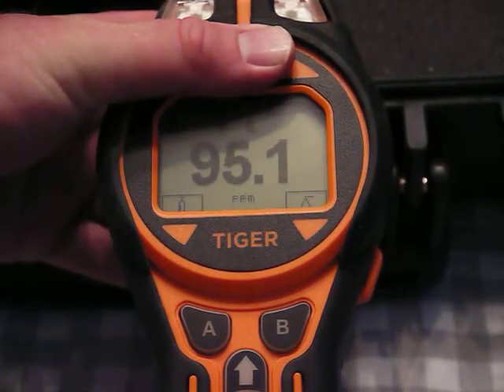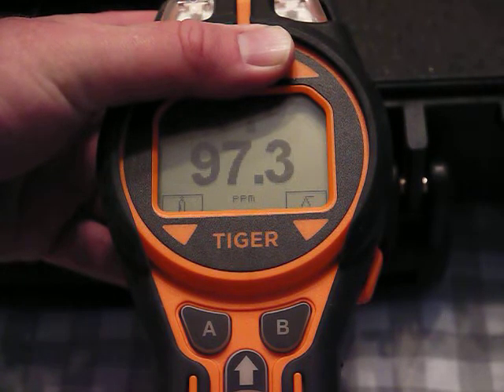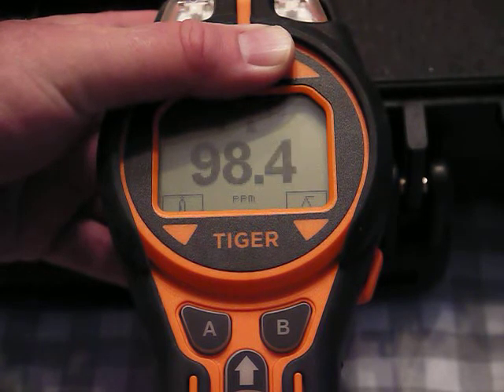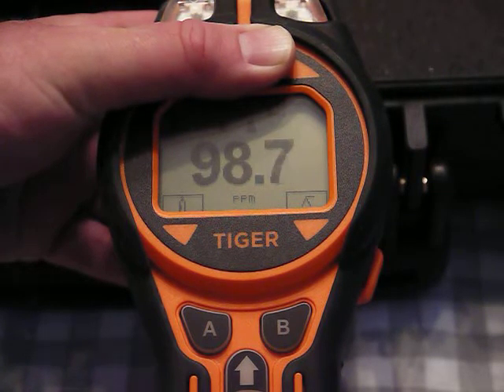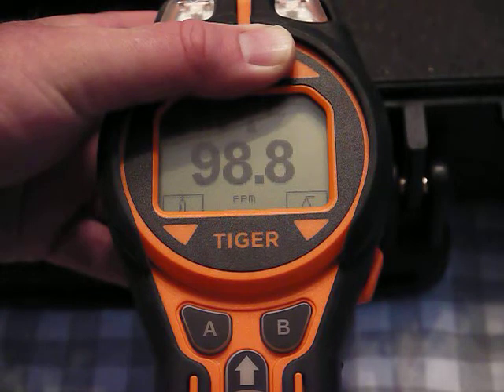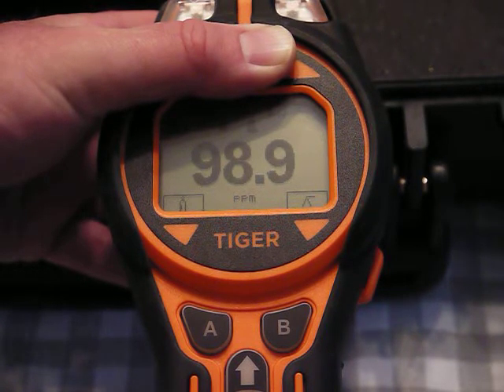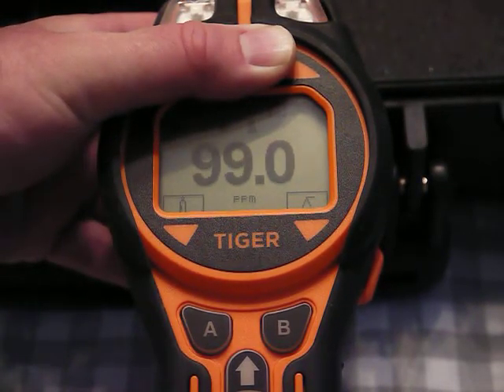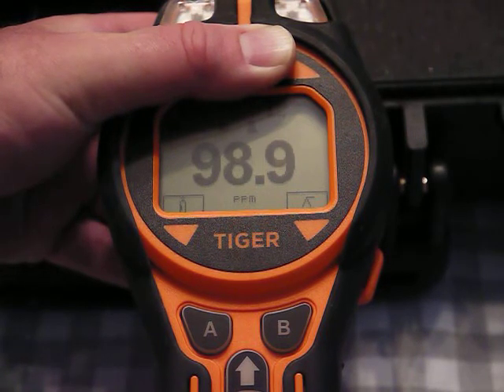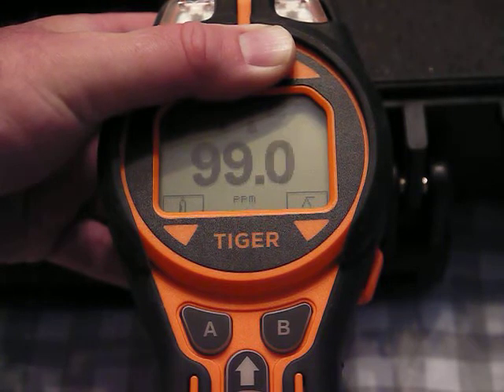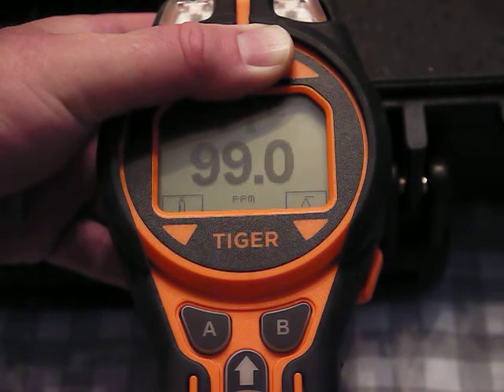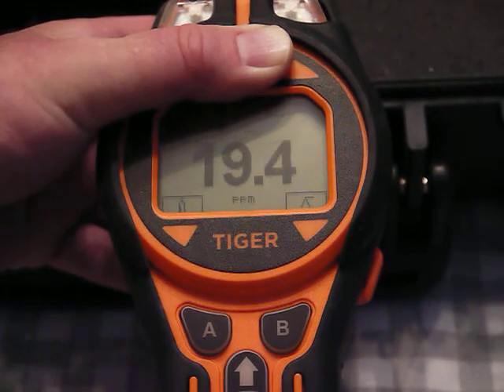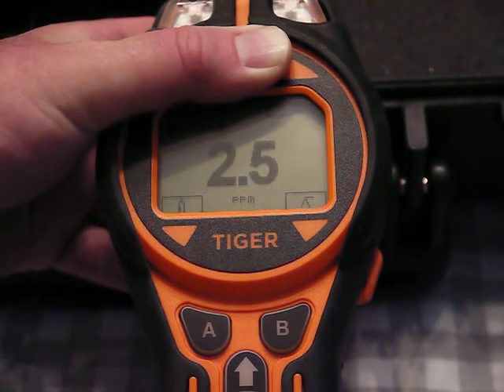Let me put the isobutylene back on again and put my hand over where we're getting those alarms. There's a bit of an error in the gas and a built-in error in the meter itself, but it should come pretty close to 100ppm. Before, we were measuring for styrene with a response factor of 0.45 and ended up getting 45. Now we're back measuring isobutylene with a response factor of 1, measuring correctly — close to 100ppm on the meter. One nice thing is how quickly the PID responds to gases and rolls back down as well.